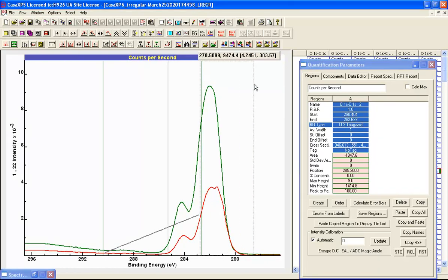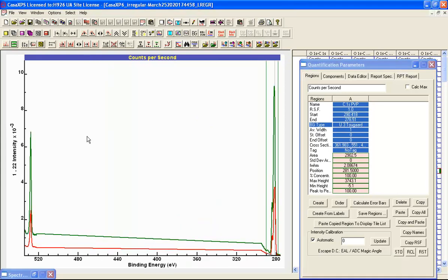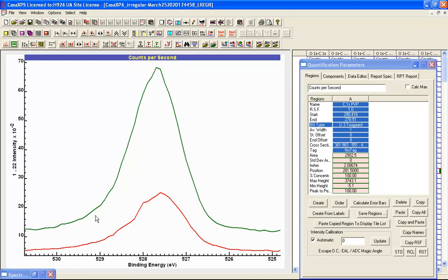And that represents a region on the carbon 1s of PVP. And I'm specifying a name that's important. This name will be used in the custom report to calculate a profile based on PVP, and I wish it to apply to both of these spectra that are in different columns. So before I propagate this, I'm also going to place a region on the oxygen peak.